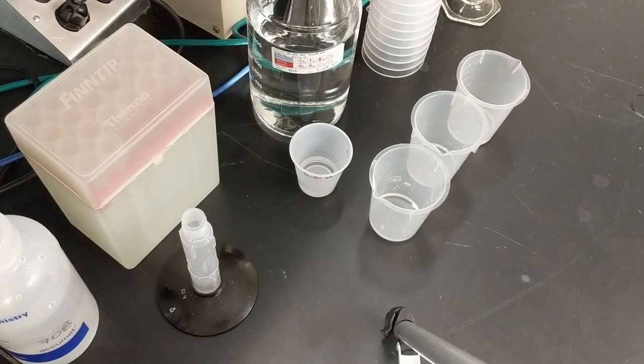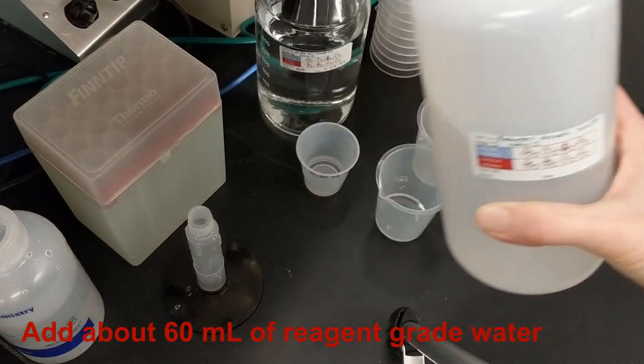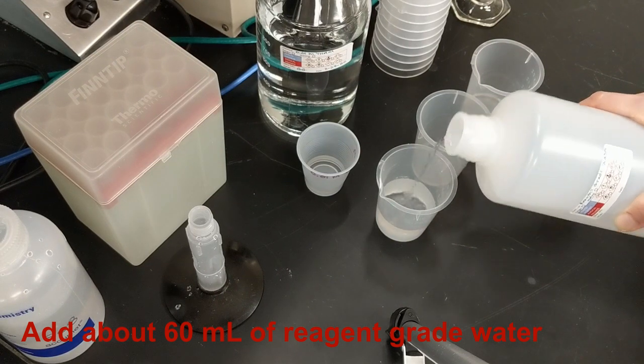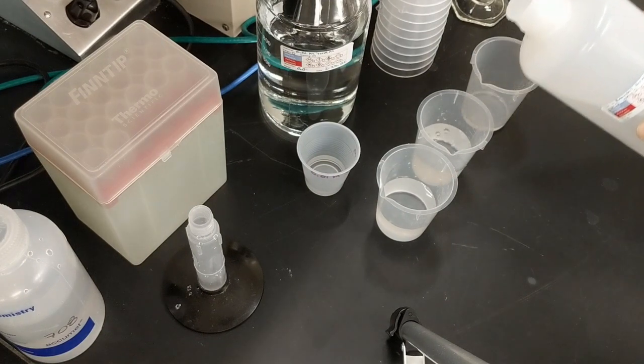Next, I'll add about 60 mils of reagent grade water to each of the beakers of standard. The reagent grade water brings the volume up to a level that will cover my pH electrode without adding any interference to the titration.